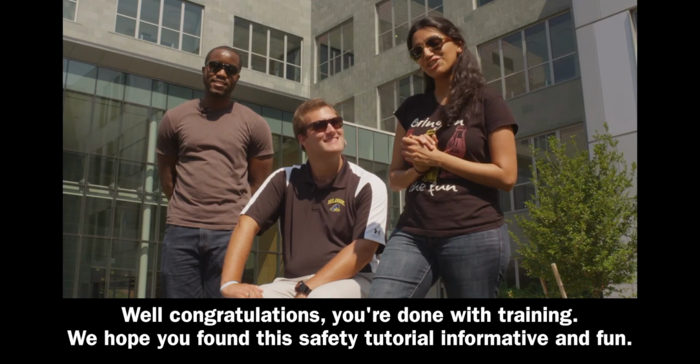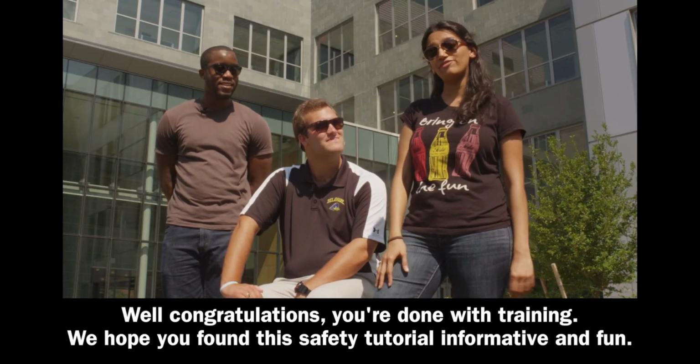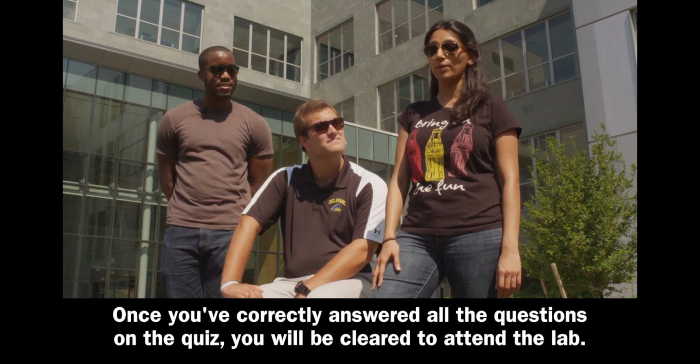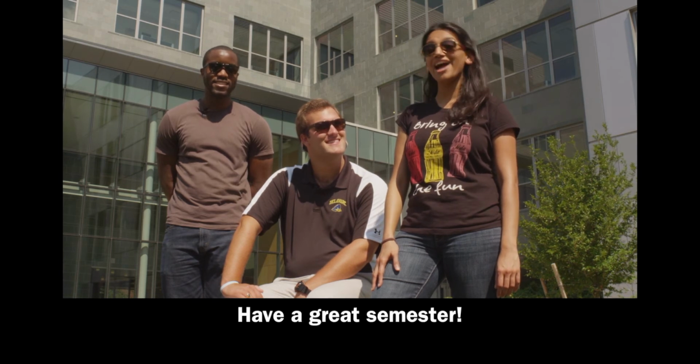Well, congratulations, you're done with training. We hope you found this safety tutorial informative and fun. Once you've correctly answered all the questions on the quiz, you will be cleared to attend the lab. Have a great semester!